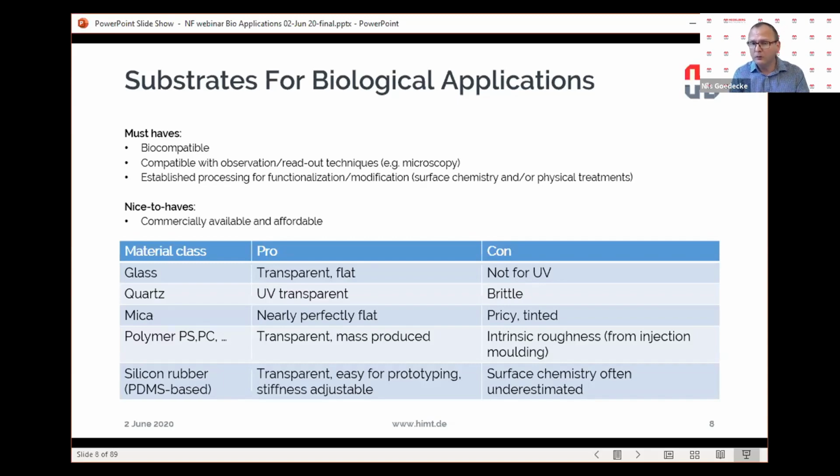But there are also flexible materials that can be used for structuring, and silicon rubber like PDMS, probably we would use after we have structured a surface, but we could use that for molding and demolding. There are also methacrylate, hydrogels, but this would not work. So anything, people ask what materials can you use with the NanoFrazor? I keep on saying, if it is flat and we can spin coat it, bring it on. We can basically work it out. And that gives us quite a bit of opportunities.